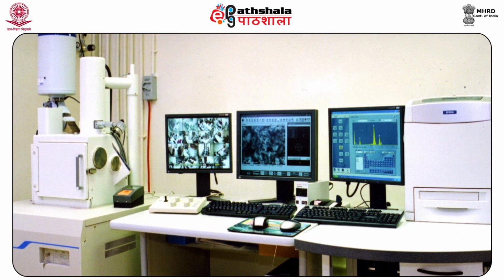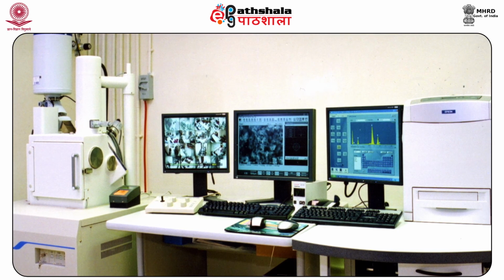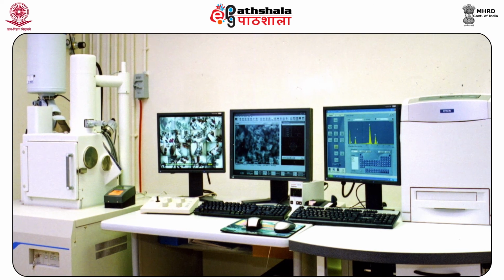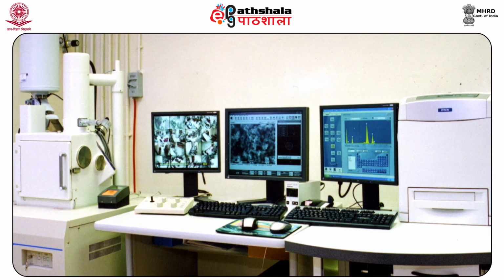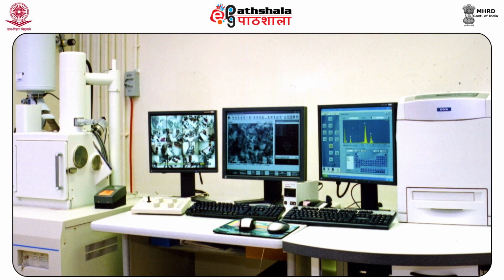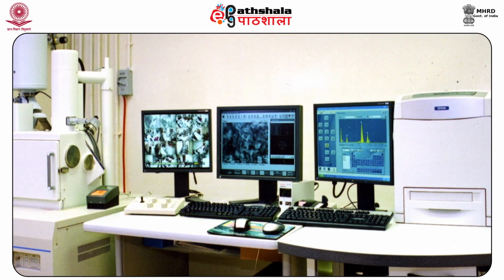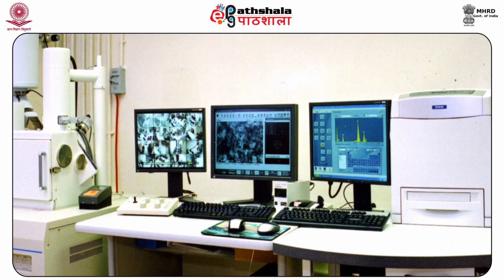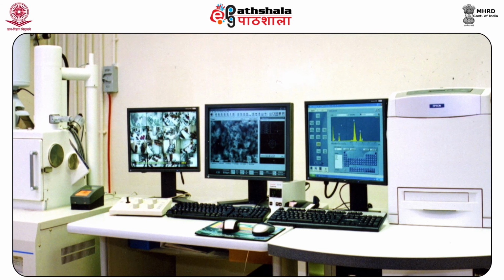that one of the biggest advantages to the forensic scientist is that gunshot residue particle analysis is non destructive in nature, and the sample can be preserved for court evidence as well. Whereas most of the techniques used for this type of analysis are destructive in nature. So, we have a benefit in this case.